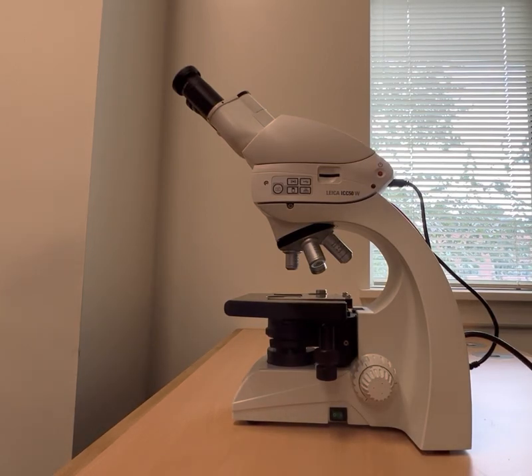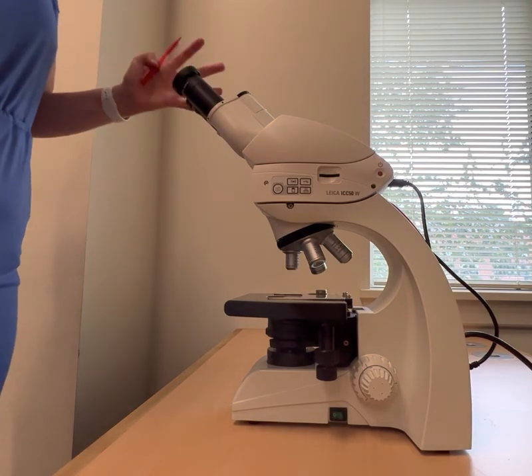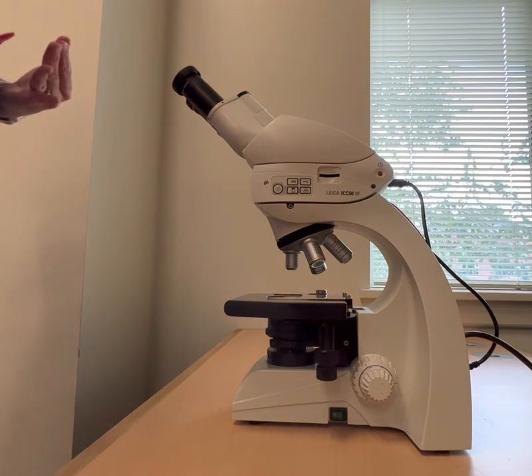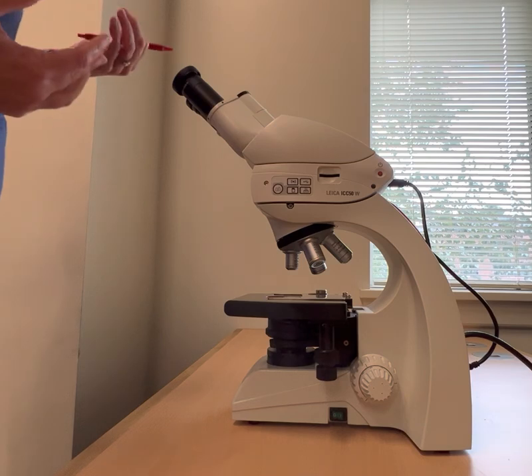Guys, so today we are going to talk about parts of your light microscope. So here we have our generic light microscope. Your microscope may look slightly different than this one, but hopefully the parts are still basically the same. So this is a light microscope.